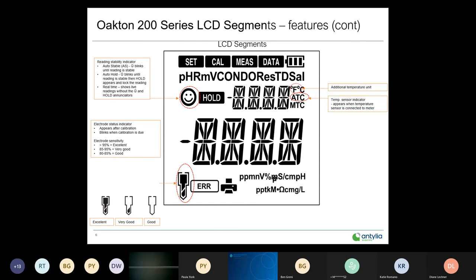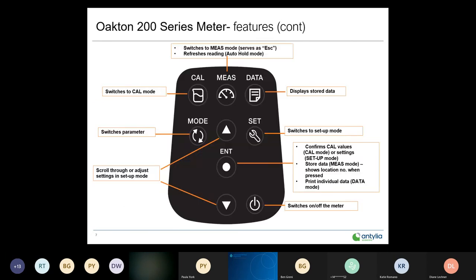Greater than 95% — that's a brand new electrode, you'll have both segments lit up. 85 to 95%, you'll have one segment — that electrode is still very good. Below 80 to 85%, there are no segments left. Once it gets below 80%, that's a good indication the electrode needs to be cleaned and recalibrated. If it's been poisoned, unfortunately it'll need to be replaced.